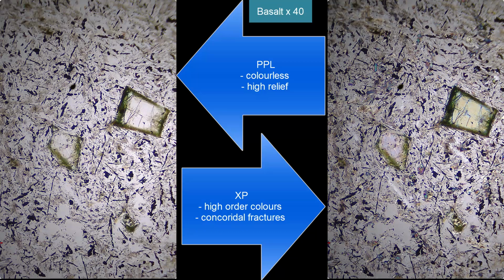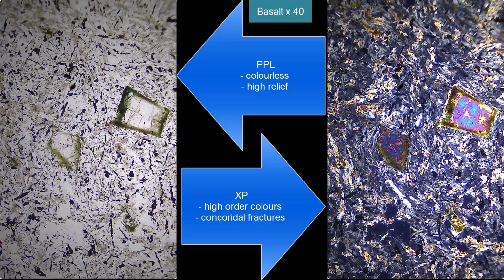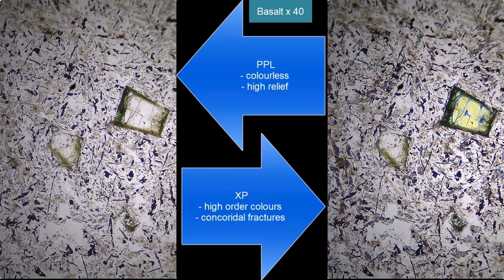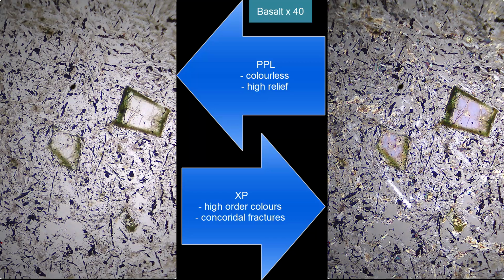So once again, it's helpful to watch the first and second one. That'll help explain 3 to 6 in a little bit more detail, and they sort of lead into each other. I wasn't actually going to do part 6, but then I thought it had some value, so you listen, you might understand why I thought it was useful.